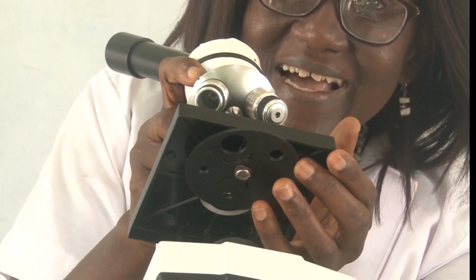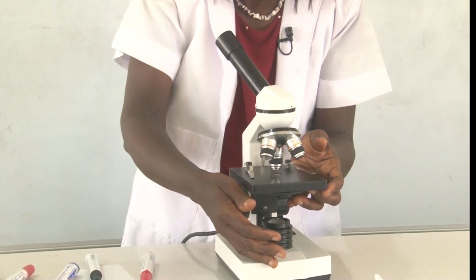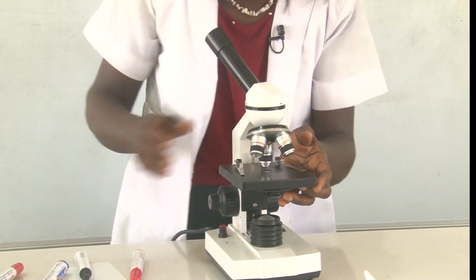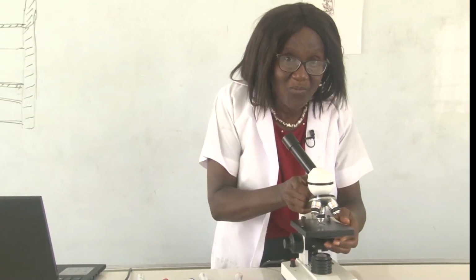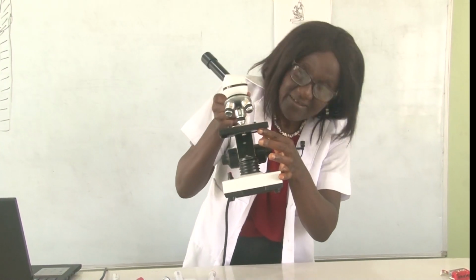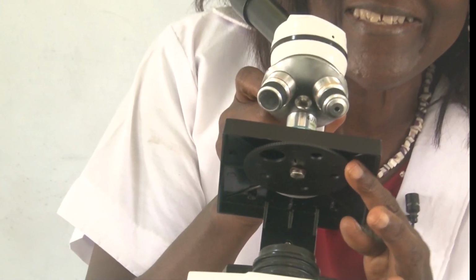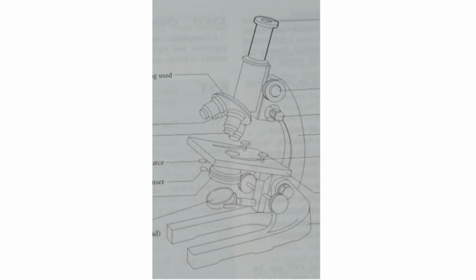So it has a condenser that concentrates the light from the mirror into the condenser, and this is a diaphragm. As we move this about, we are regulating both condenser and diaphragm.